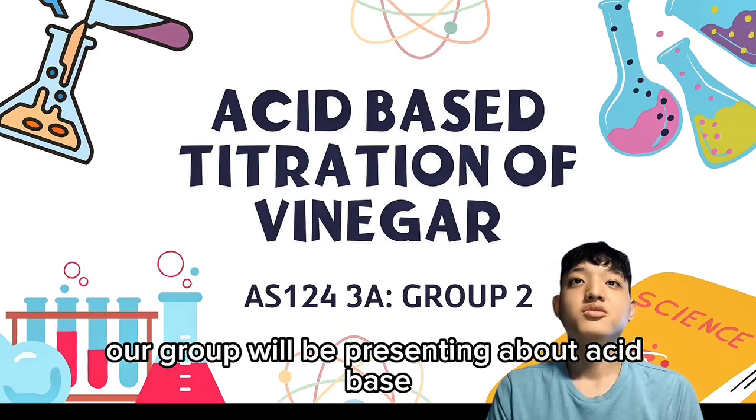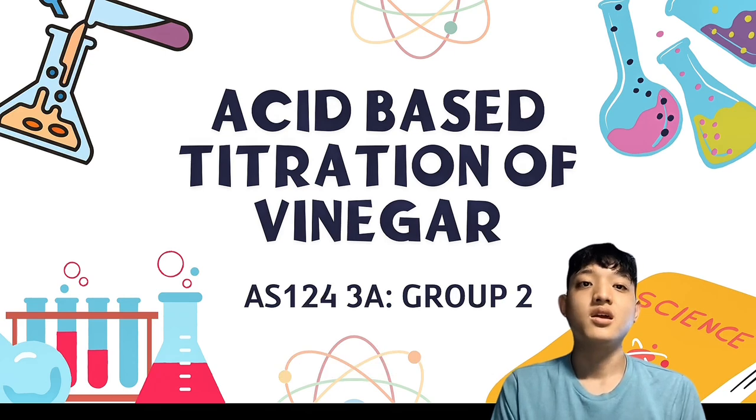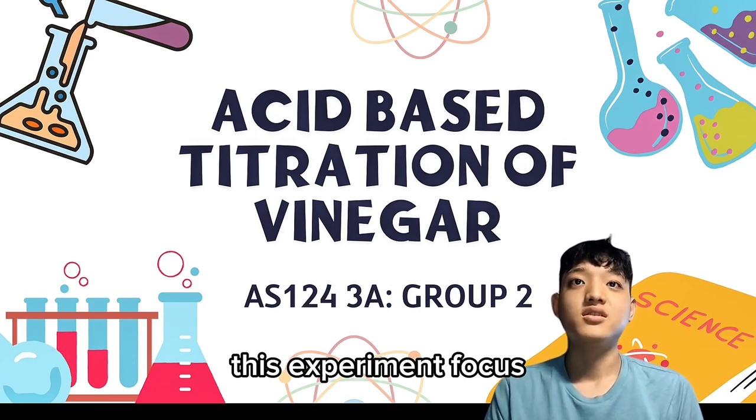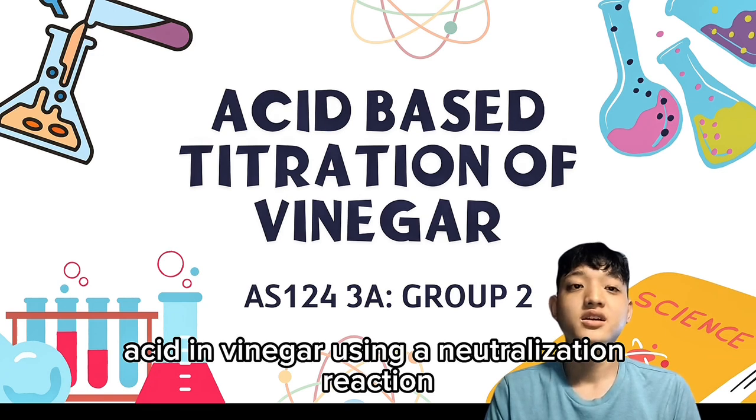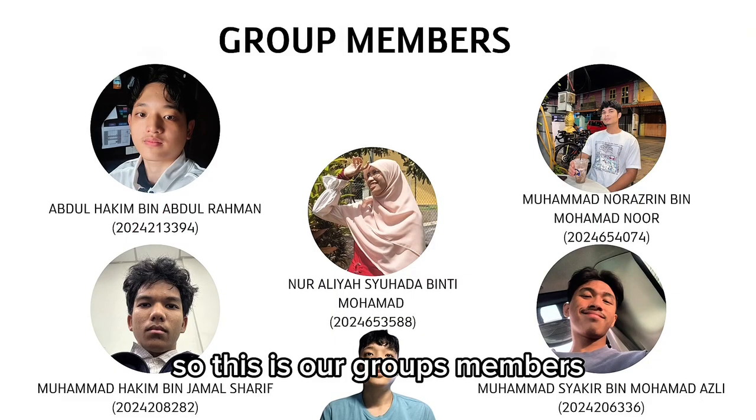Assalamualaikum. Today our group will be presenting about acid-base titration of vinegar. This experiment focuses on determining the concentration of acetic acid in vinegar using a neutralization reaction. So this is our group's members.